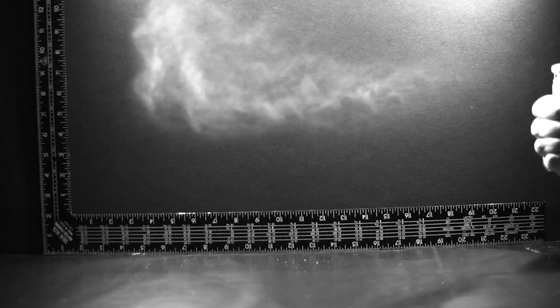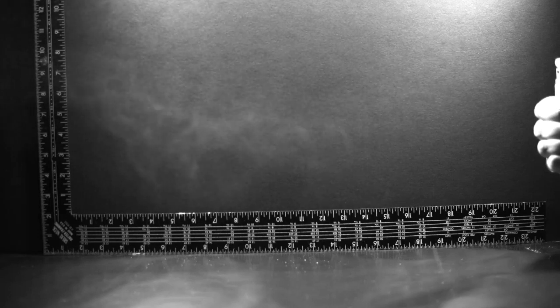So my project involves two main areas. The first is to examine spray characteristics of my formulations, and that's looking at the pattern that a spray makes when it hits a piece of paper a certain distance away from the spray, as well as looking at high-speed videos of the spray plumes as they develop over time, and examining the differences between formulations and nozzles that way.